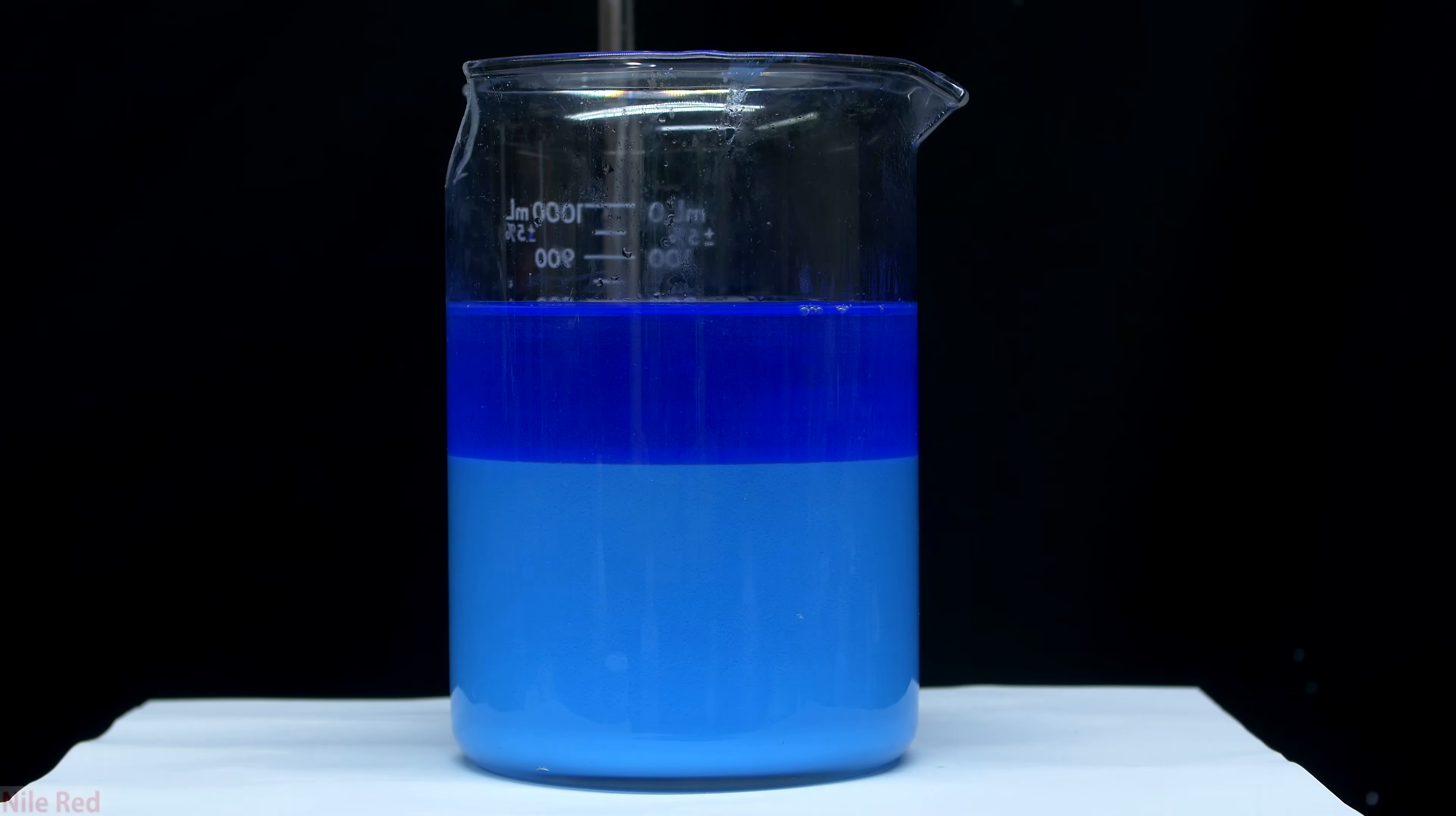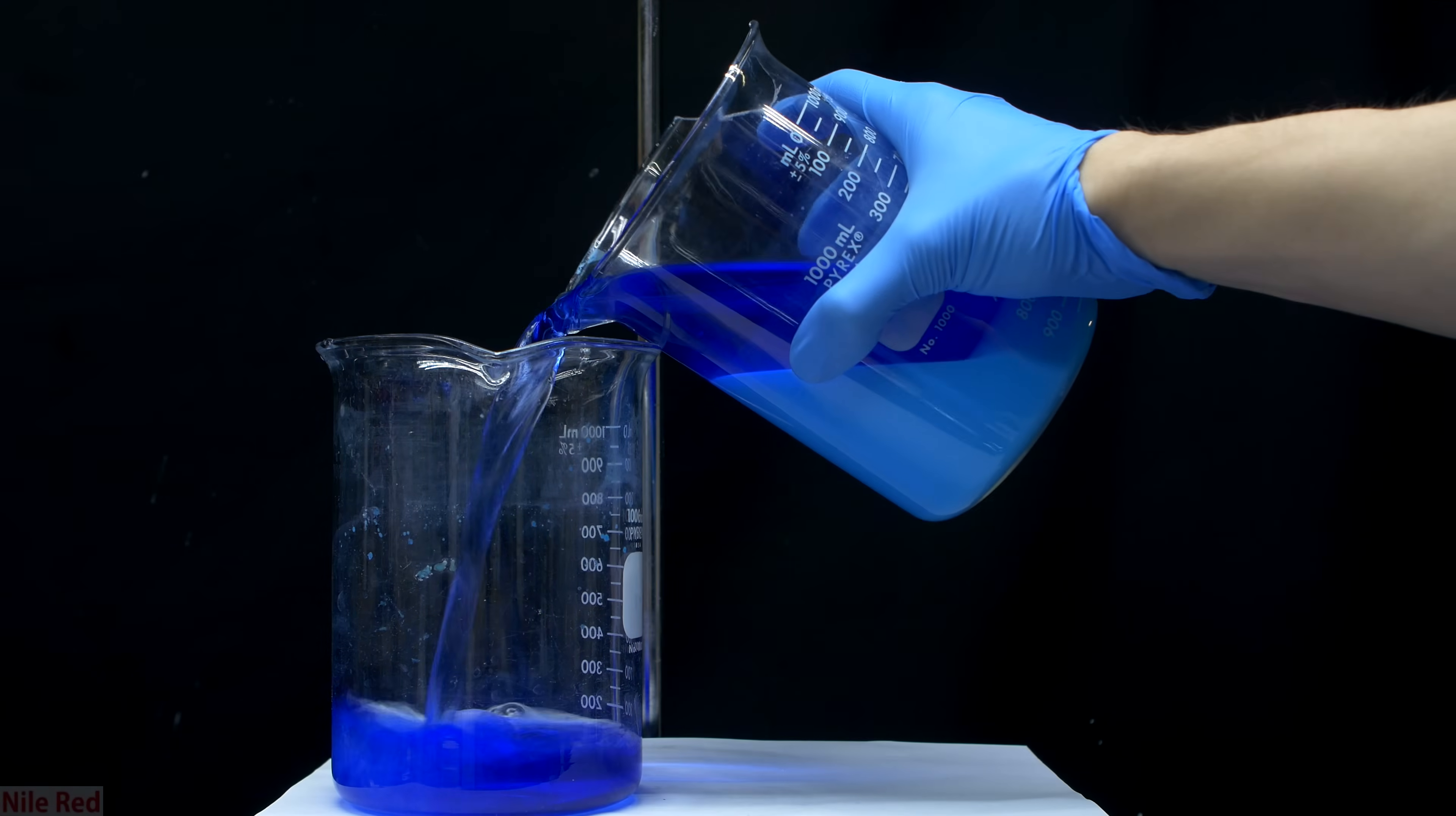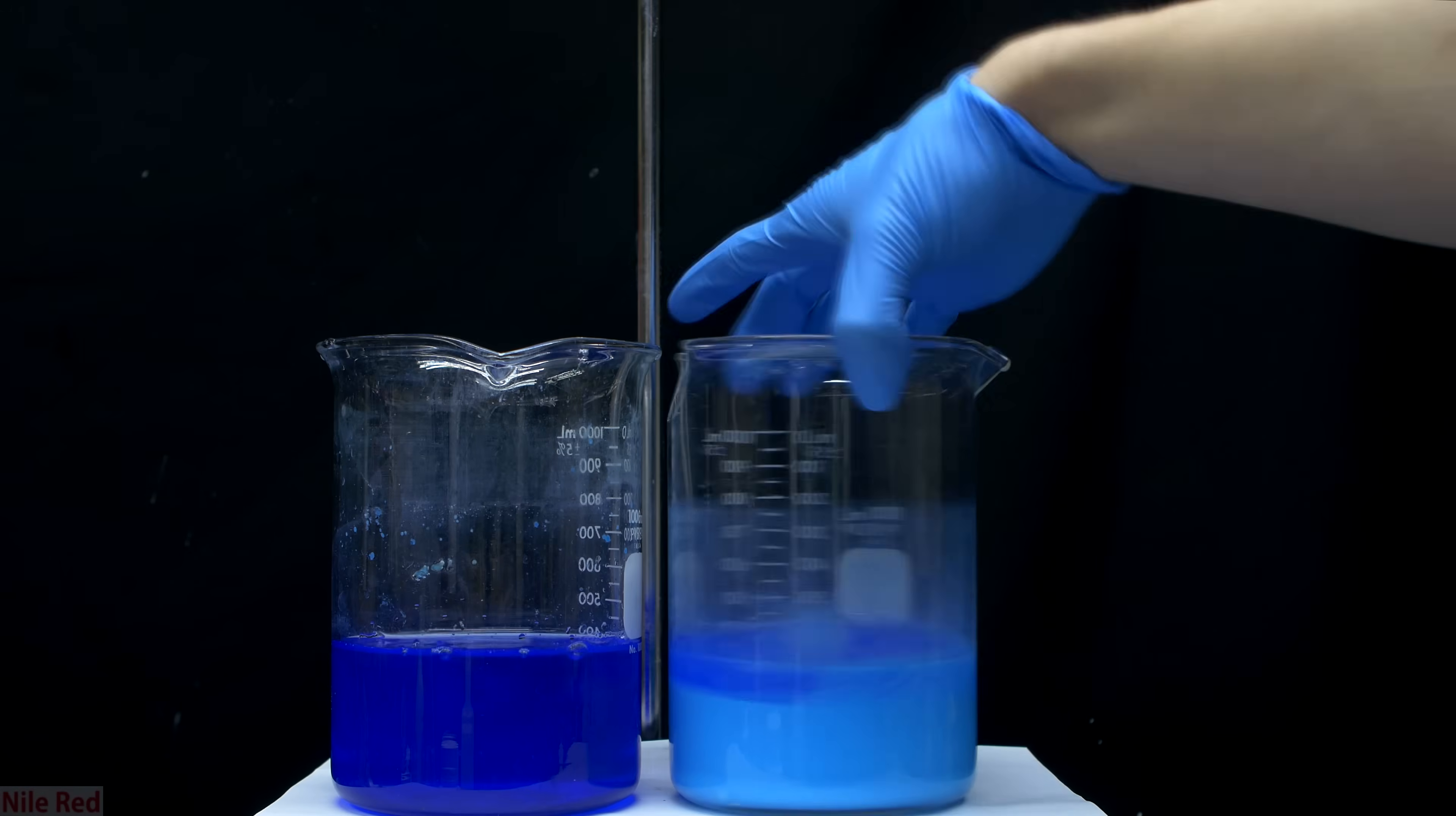I let it stir for several minutes, and then I allowed it to stand for all of the copper hydroxide to sink to the bottom. Eventually, most of the copper hydroxide had sank to the bottom, and I decanted off the upper water layer. After we've poured off most of the water, we can move on to our filtration step.